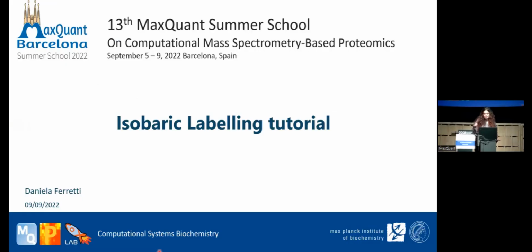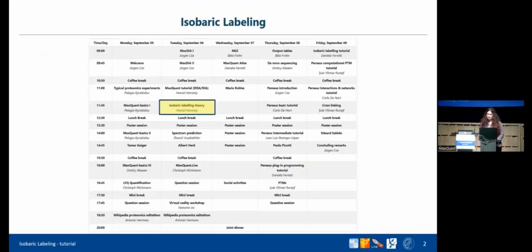Good morning, everybody. Today we will start with another tutorial, the MQSS and Perseus tutorial, focusing on isobaric labeling. We already talked about isobaric labeling last Tuesday. The theory part, Hamid presented to you in an amazing lecture, and today we will do in practice exactly what he presented.